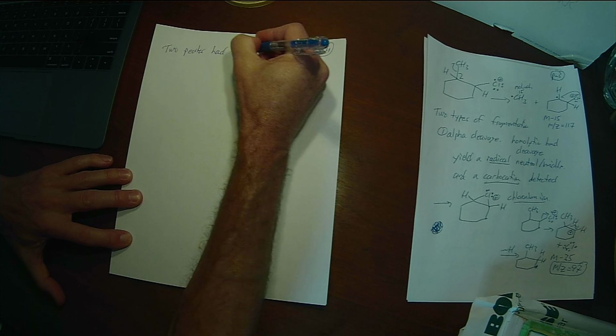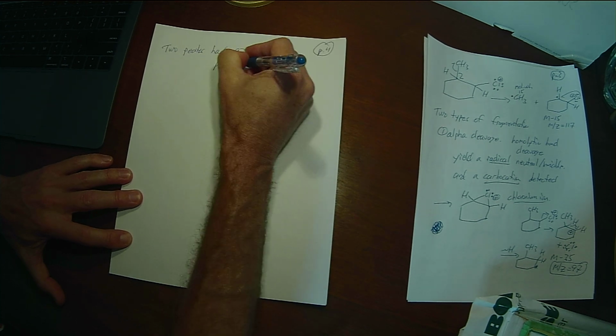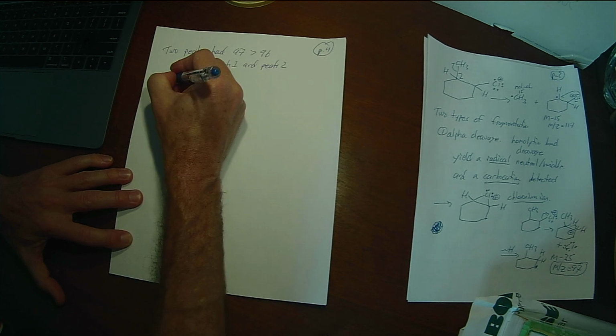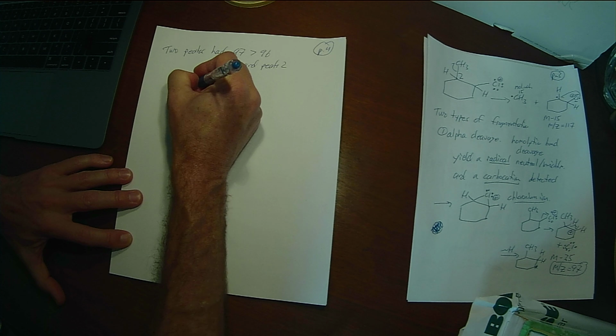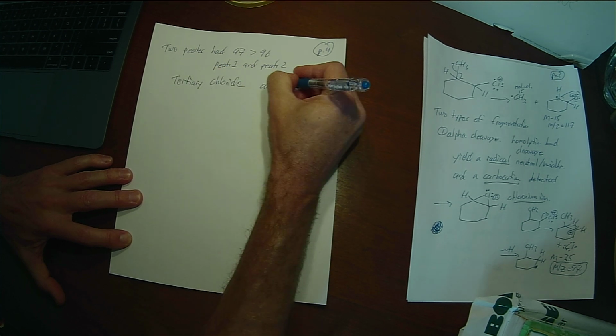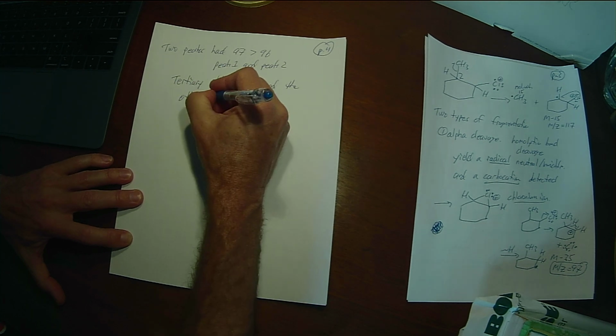First and second peak. All right, so that was peak 1 and peak 2. One of those is probably the tertiary chloride, and the other is probably one of the secondaries, one of the 2-chloro derivatives.